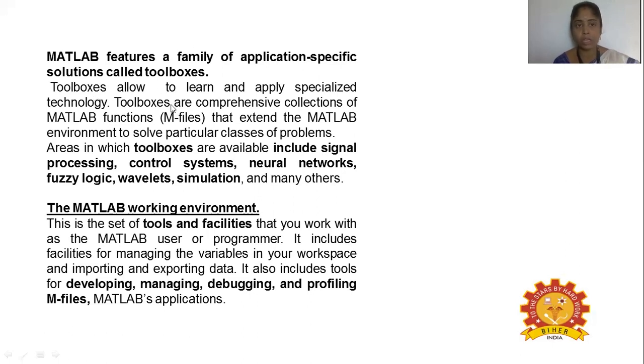So this toolbox allows us to learn and apply the various technology, and it is a collection of various files that can be used to solve various classical problems in bioprocess. This toolbox includes signaling, how it is sensed with the help of sensors, which can be used as a toolbox. Then how it can be controlled. If the temperature goes beyond a particular set point value, the control system, in which the thermometer senses it, can control it.